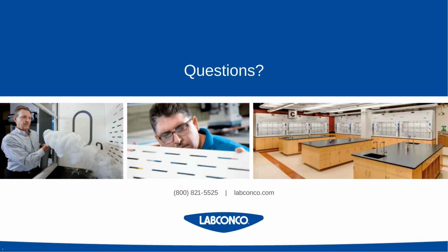Also, if there's no backdraft prevention in place and the hood just gets turned off when maybe all of the vapors haven't been exhausted, if there's a difference in pressure between the room and outside, those chemicals could actually be drawn back into the lab space. So having the hoods always on is safe because it keeps everything under negative pressure. If anything was not done correctly, you can ensure that if there's residual chemicals, they're being taken out of the building and not lingering in the lab space, keeping everybody safe.